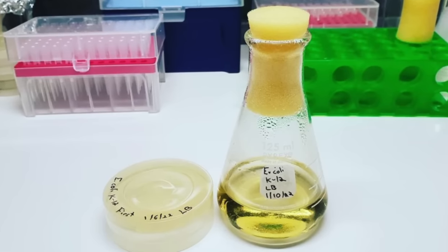And the idea there is that along with your gene of interest, your genetic circuit that you want to put in the plant, let's say make it glow in the dark or turn blue, right next to it is the gene for antibiotic resistance, right? And that'll allow the bacteria that carries your genetic payload to be selected against all the other bacteria that don't have it, right? And so antibiotics play a massive role in the construction of genetic elements.